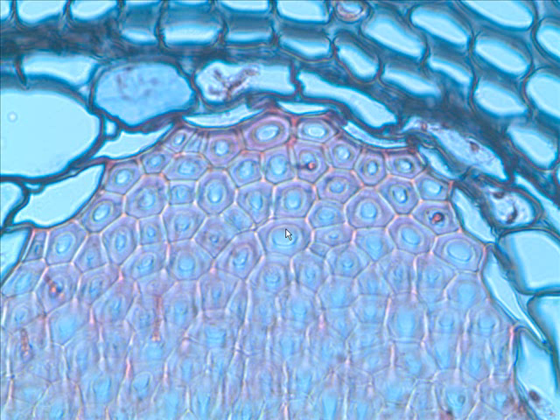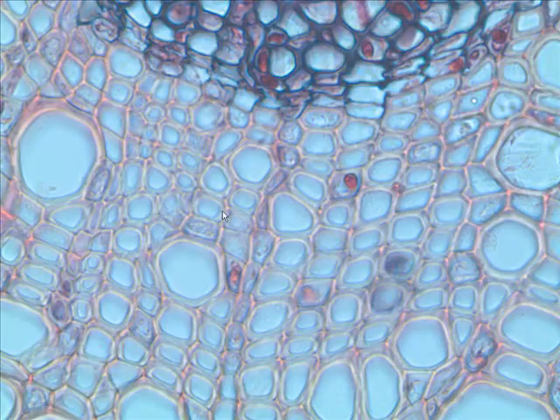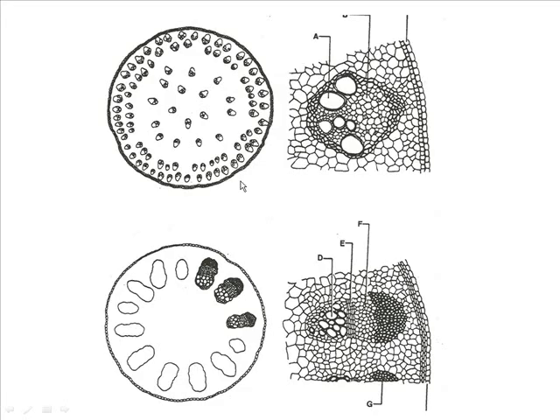Fibers do not carry anything through them. Those hollows are just inside the fibers. They don't connect to the outside. And so what do fibers provide, though? Wherever you find them, they provide what? Strength. They're tough cells. And here's the sclerenchyma. Right inside the sclerenchyma is the what? Primary phloem. And then inside the primary phloem, we have the primary xylem.